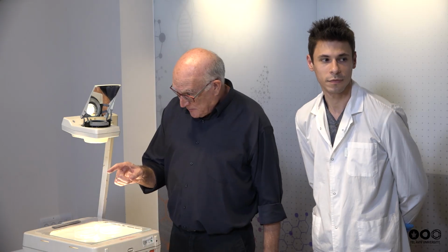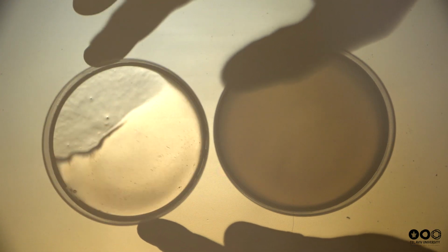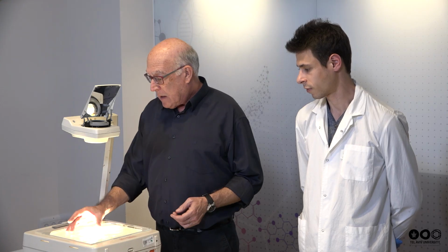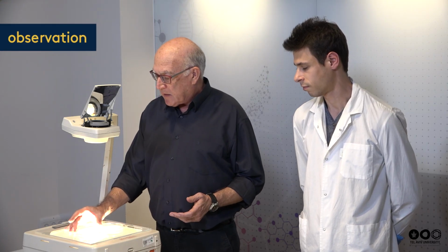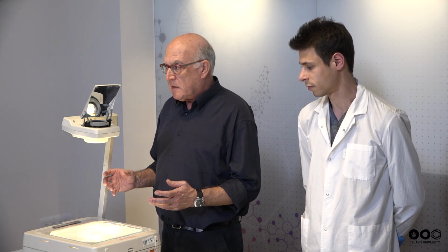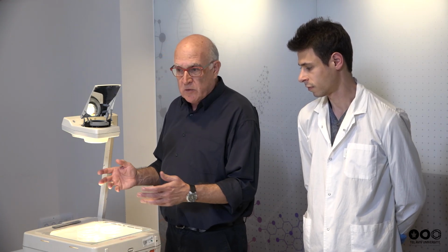Looks like snot. Very good, Jake. Actually, it does look like snot, but snot isn't the scientific term. It's viscous or mucoid. It looks like mucus. And that's indicative of the fact that by breaking open the bacteria, something has been released into the general solution. And what do you think that is?